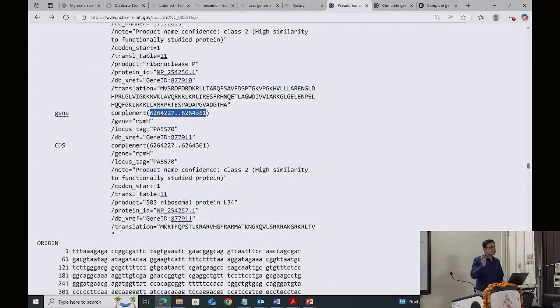And the last 15 nucleotides, you know the coordinate of that, because the last nucleotide has the same coordinate as the genome size, right? So you know the coordinates of the last 15 nucleotides, and then you will check whether that is overlapping with this or not. So, what is the size of this genome?